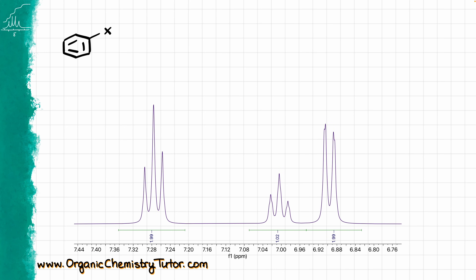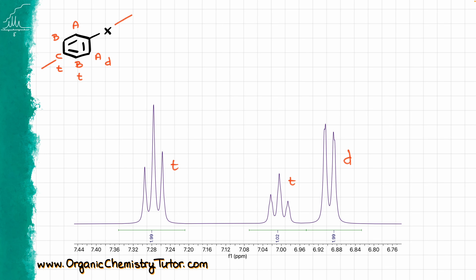My next block is going to be various types of aromatic signals. I want to start with just a simple aromatic ring by itself. Due to the internal plane of symmetry within the aromatic ring, we should expect to see three signals. Protons A give doublets, protons B give triplets, and protons C also give a triplet. Looking at the example on screen, I have a triplet, another triplet, and a doublet — a nice clean aromatic ring, no problems with that.